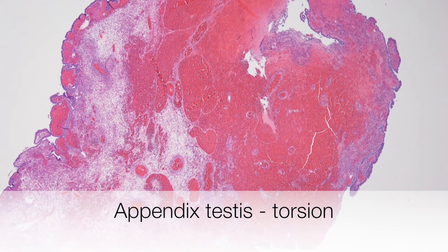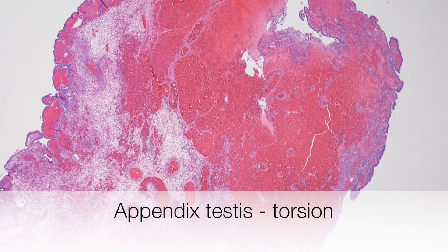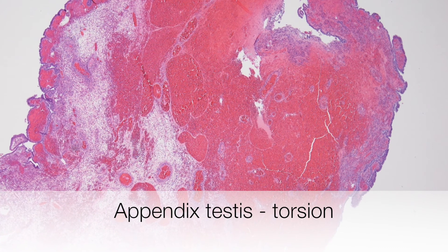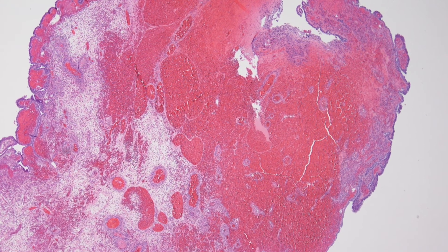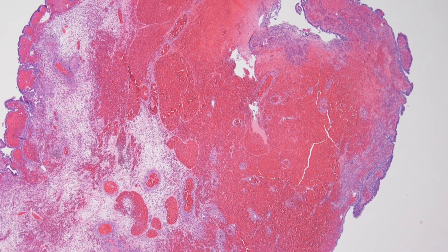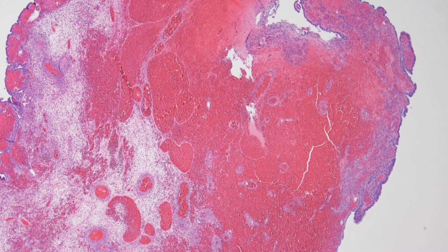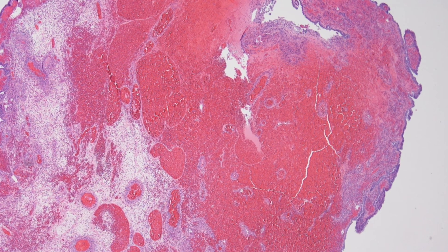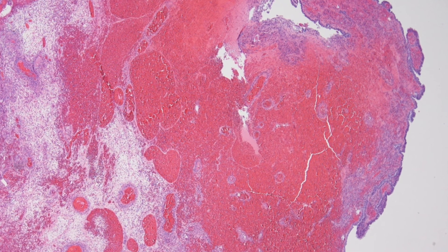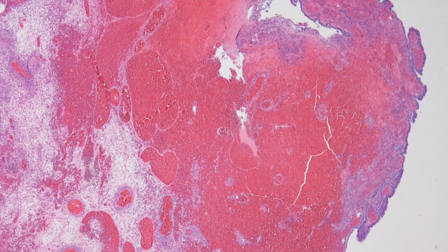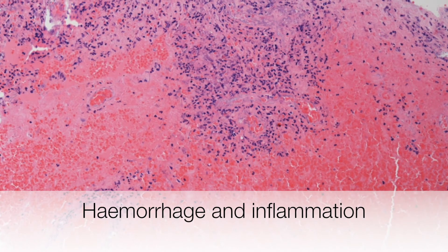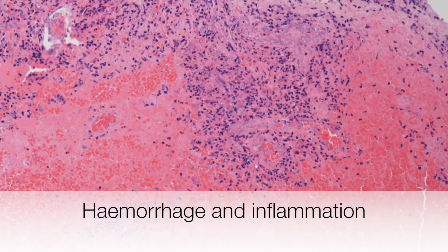The normal size of the appendix testis is 2–4 mm, but if it becomes twisted it can enlarge with congestion, oedema, and inflammation to a size of up to around 1 cm. Here you can see haemorrhagic infarction and acute inflammation.